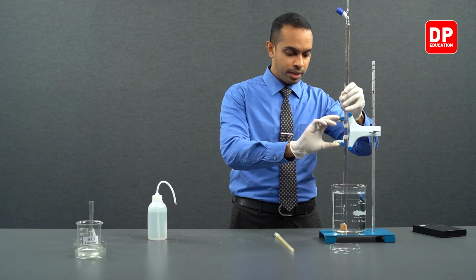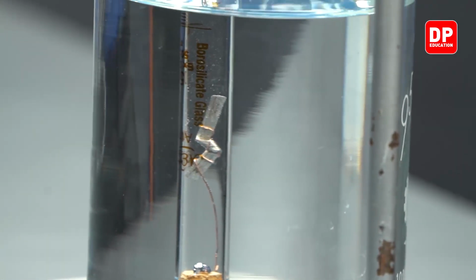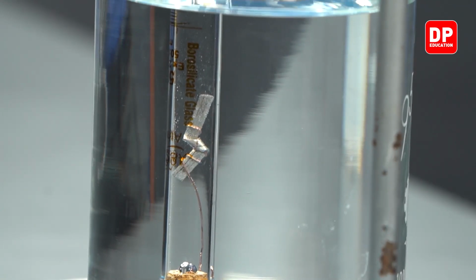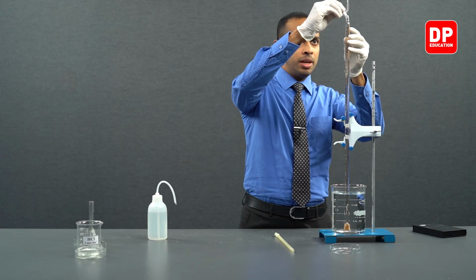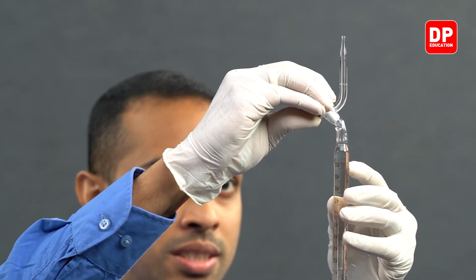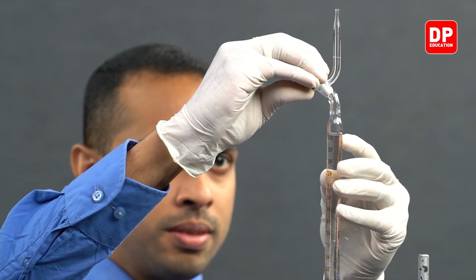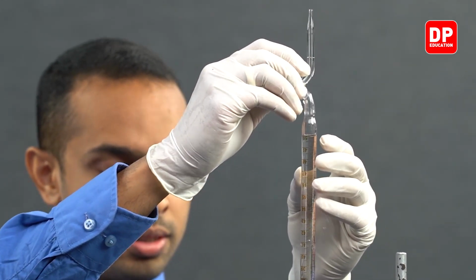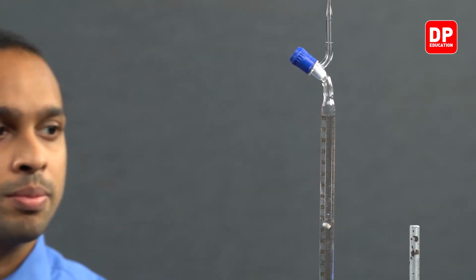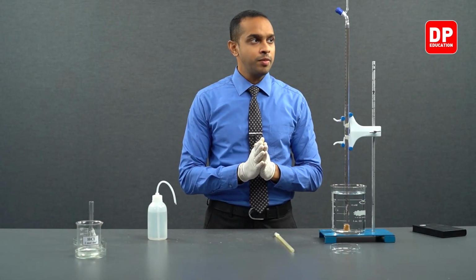We'll place it properly like this, and now we'll have to make sure that we bring the water level to the 50 milliliter mark that we have over here before the reaction starts.